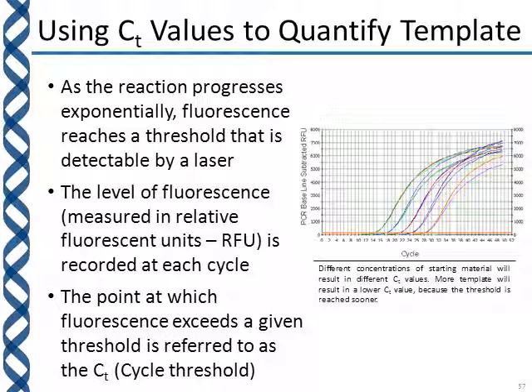So if you look at the graph on the right, you see that orange line down at the bottom, that is the baseline level of fluorescence. And this particular graph, if you look on the left axis, says PCR baseline subtracted RFU. So this graph has been normalized to subtract out that baseline fluorescence and really only report the results above that baseline. So you see the curves. There are some replicates in there. As you can see, there's several different colored lines that kind of line up all together. And there's a lot that goes into reading one of these qPCR readouts, and we won't get into all of that. But I just want to introduce you to some of this.